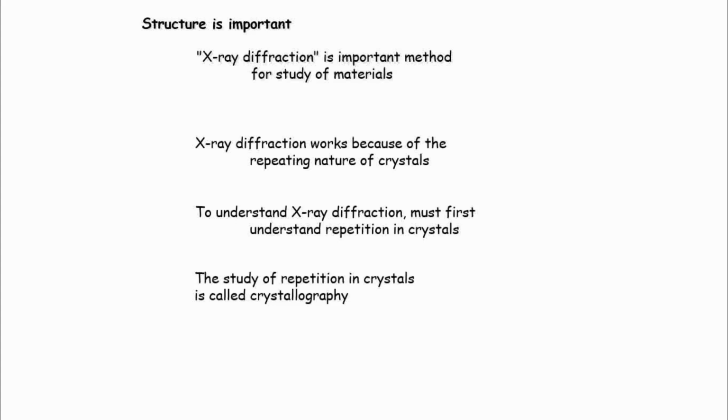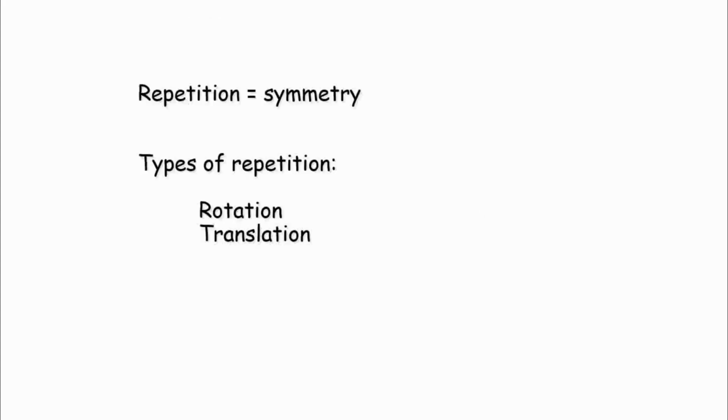Okay, so basically it is a repeating type of doing it, because we are not going into the holistic thing here. We are trying to get your sample into the form of a crystal, and once it is in crystal, it is in a solid fixed state, there is no movement, it is more or less in a fixed orientation, and then in this fixed orientation crystal we are trying to reduce it to one small unit cells or lattices, and then once we understand this lattice's behavior, it can be repetitive in the entire crystal, right?